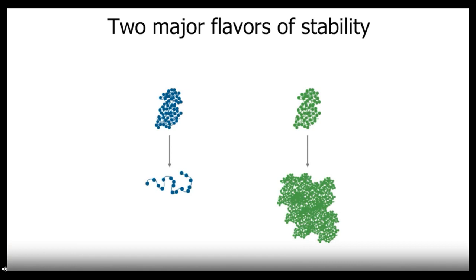When thinking about the stability of a protein, we can summarize it as two different types of stabilities, conformational and colloidal. Conformational stability, shown in blue on the left, is the ability of the protein to stay folded in its native state. Thankfully, examining protein fluorescence is one way to get insight into the conformational stability of a protein and is an easy way to examine thermally induced unfolding.